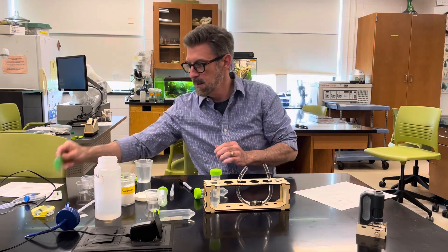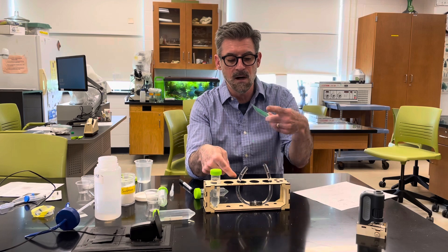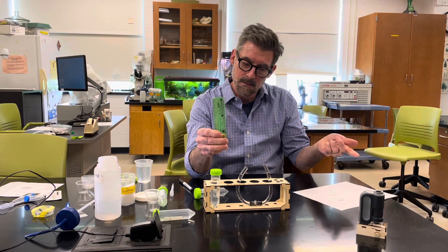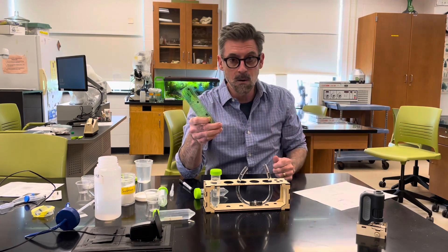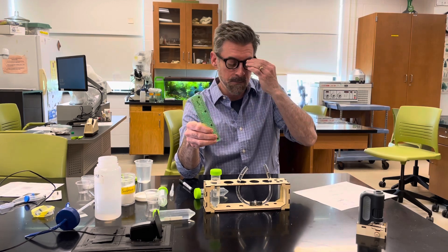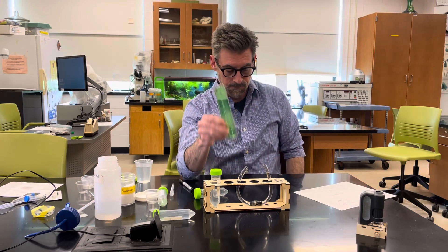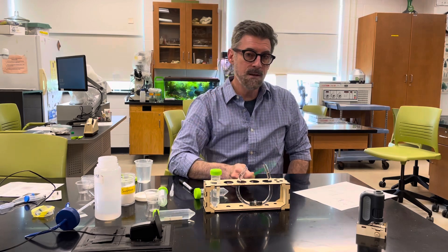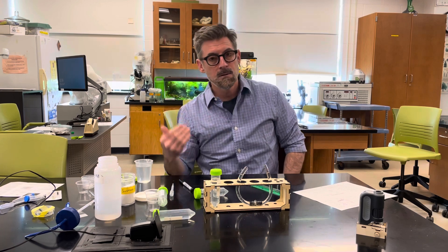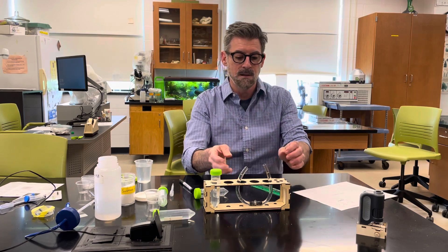After six hours, use your ruler to measure whether the liquid level has gone up or down on each side — for the water side and the sugar side. Record the change: use a plus for up and a minus for down, measured in millimeters. Then repeat the measurement after 24 hours. So you mark it at six hours and again at 24 hours, and then you're done with that concentration.